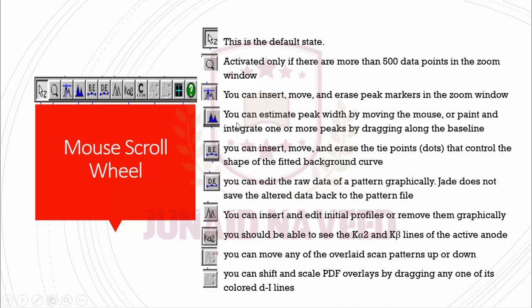With this button you can estimate peak width by moving the mouse or paint and integrate one or more peaks by dragging along the baseline. With this button you can insert, move, and erase the tie points that control the shape of the fitted background curve.